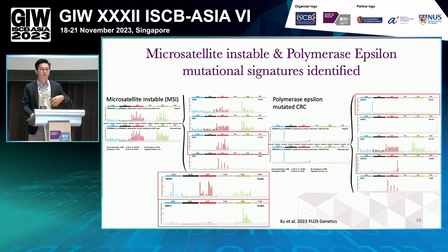So essentially, I revisited that same CRC dataset to look at the signatures. So in the paper, they actually identified 5 cases with microsatellite instability. They found out by staining and looking at the mutations in the sample as well. But in this sense, I tried to call, this is an older data set, it's actually older chemistry, and you can actually identify the MSI signatures in the red boxes over here. So SBS6 is one of those, 44 and 21. So essentially, this recapitulates what they found clinically when they actually stained the sample, for example.